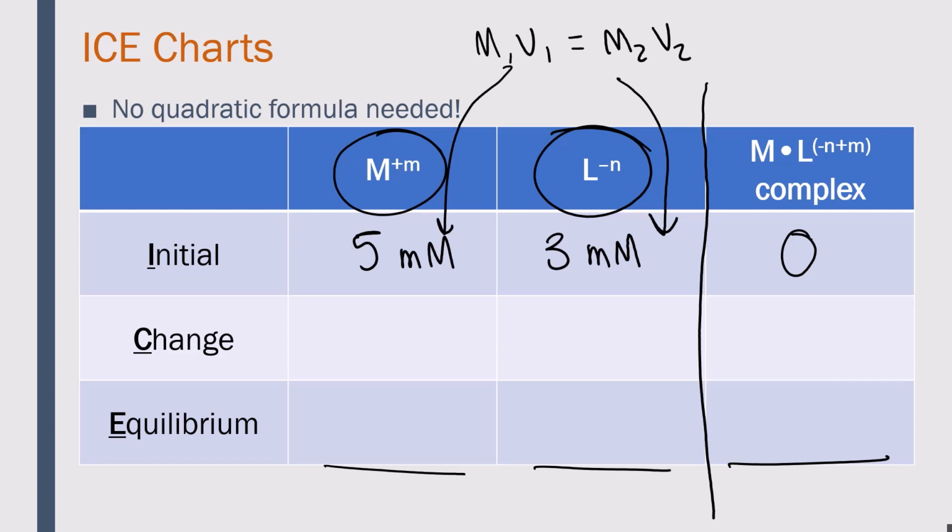So go back to that first step, mentally. You had your Beer's law plot of those standards that tell us at this absorbance value, we know that there is this much of the complex present in solution. So if you take the absorbance of your metal-ligand complex, you can backtrack using the Beer's law plot line of best fit to figure out the concentration of the metal-ligand complex.